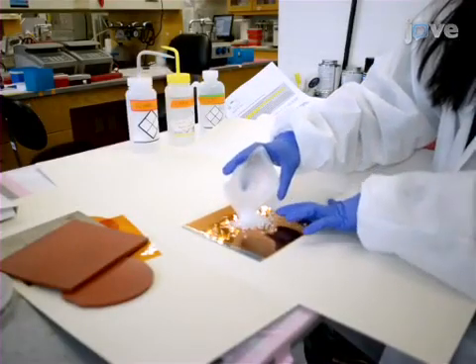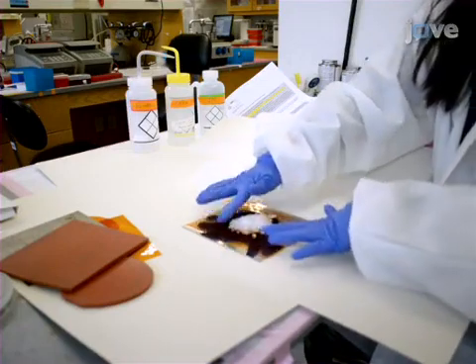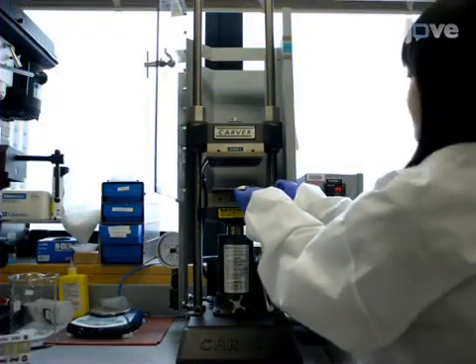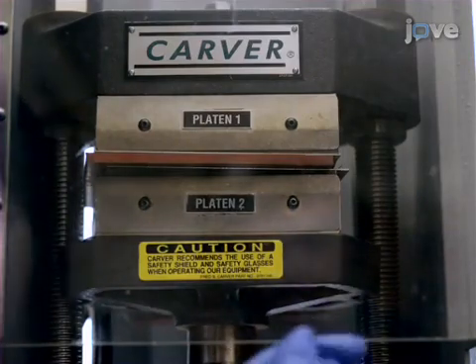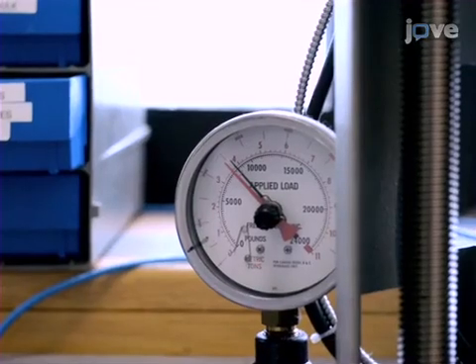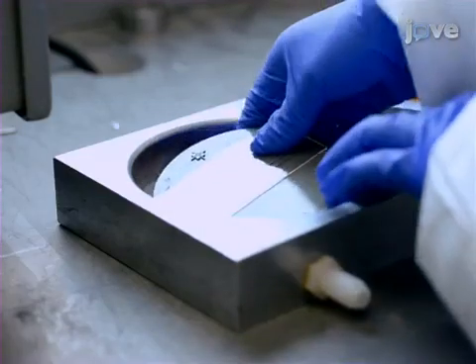To create two plaques, distribute approximately nine grams of Xenex pellets evenly in the center of a metal plate. Place on a 198 degrees Celsius heated press for five minutes, then apply pressure slowly to 2500 psi for another five minutes. Now position one plaque onto the epoxy mold, preheat at 157 degrees Celsius for 10 minutes, and apply pressure slowly to 1000 psi.